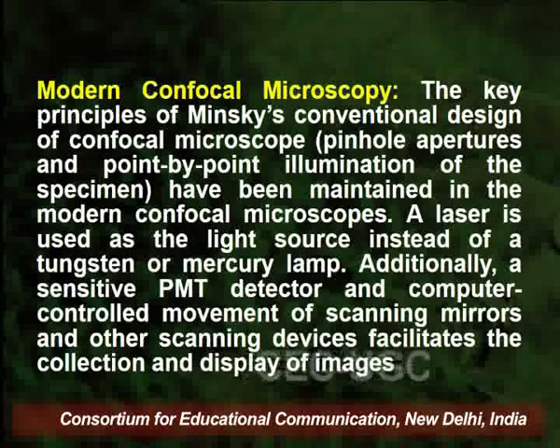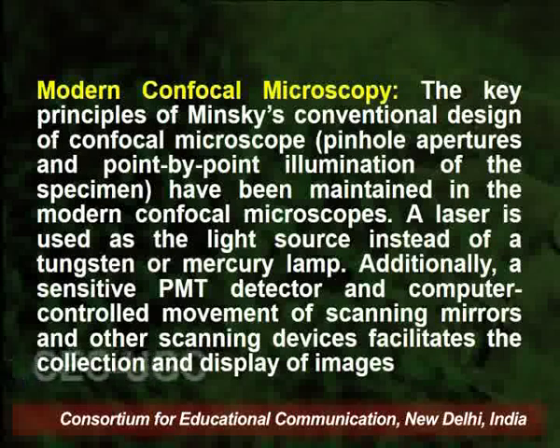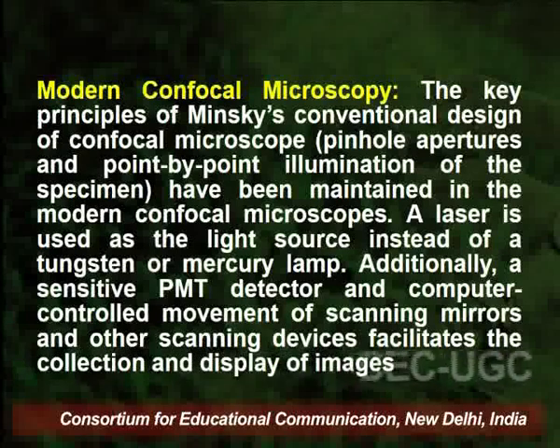The key principles of Minsky's conventional design of the confocal microscope have been maintained in modern confocal microscopes also. A laser is used as a light source instead of a tungsten or mercury lamp, and additionally a sensitive photomultiplier detector and computer controlled movement of scanning mirrors and other scanning devices facilitate the collection and display of images.